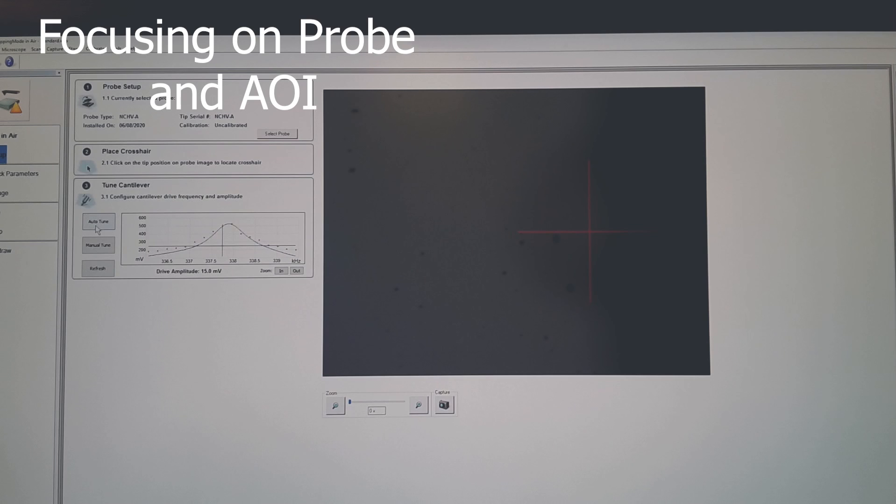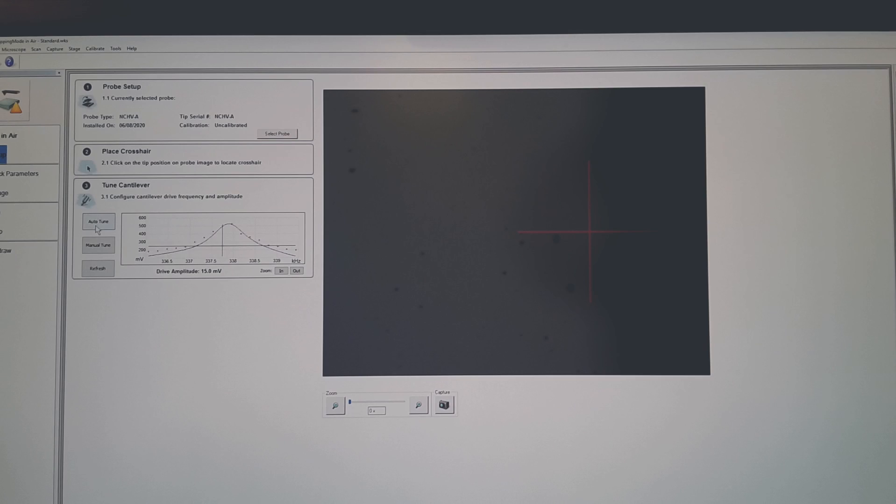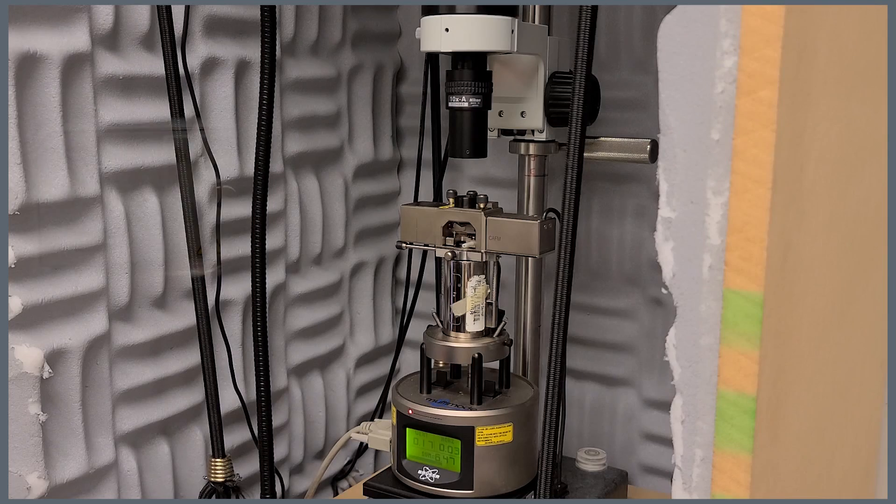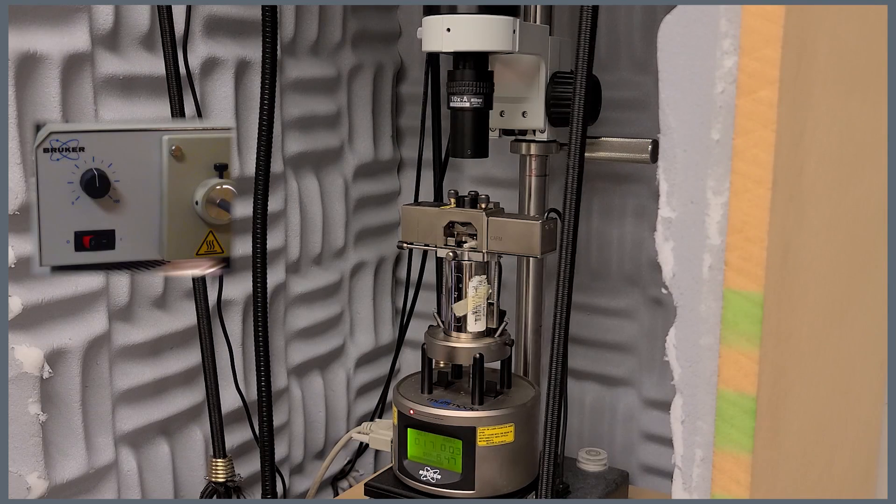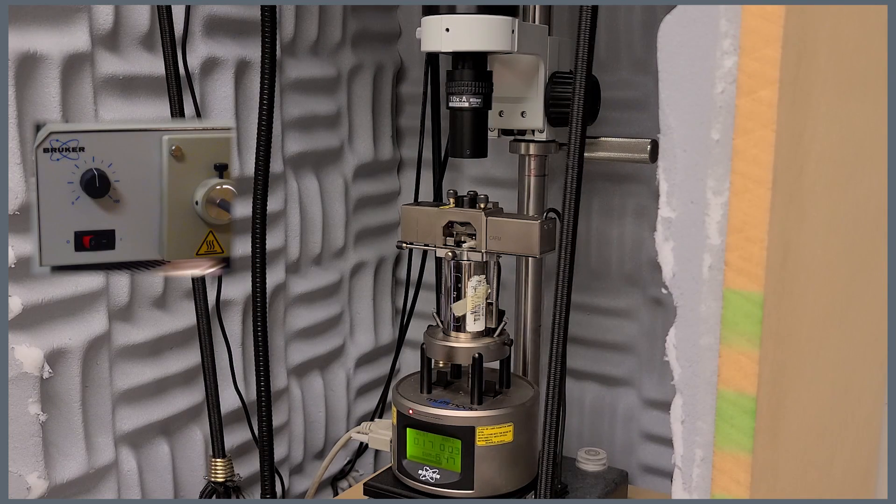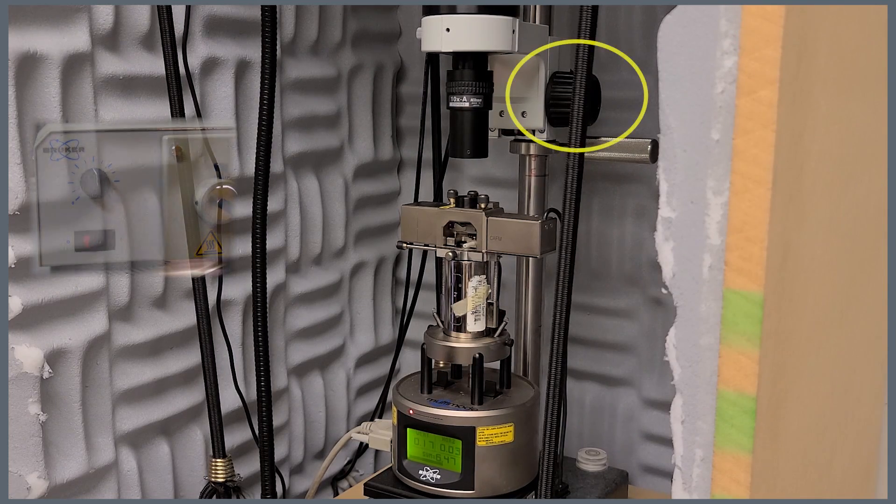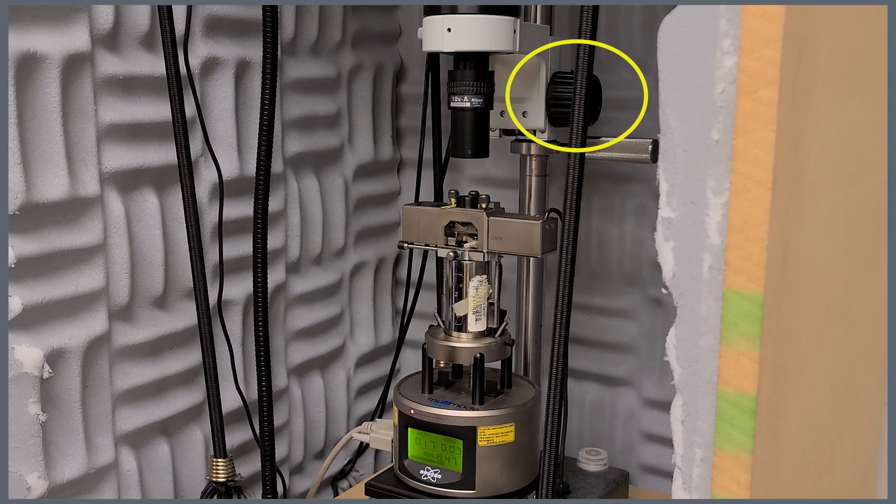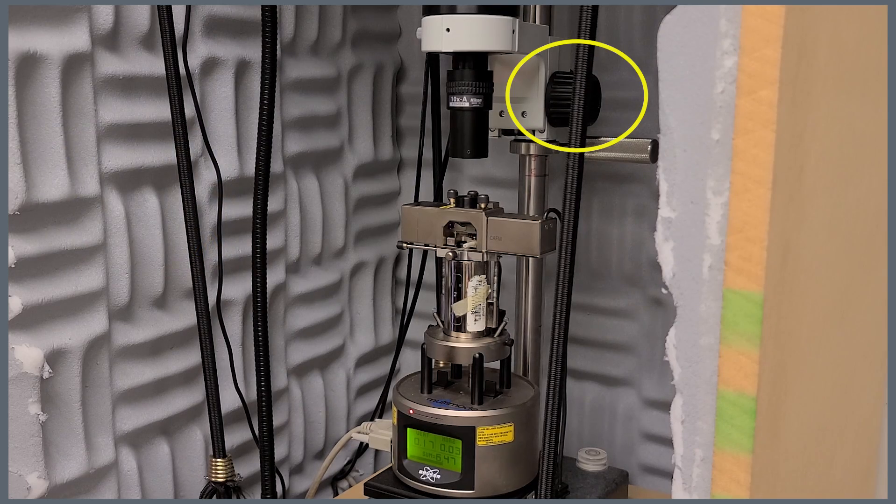Return to the setup menu and select auto-tune. The drive frequency is automatically set to your specific probe type. With the illumination on and set at half intensity, start bringing the camera down while observing the live image.